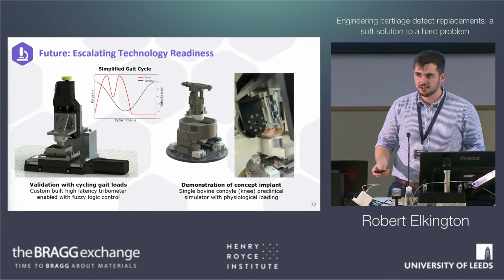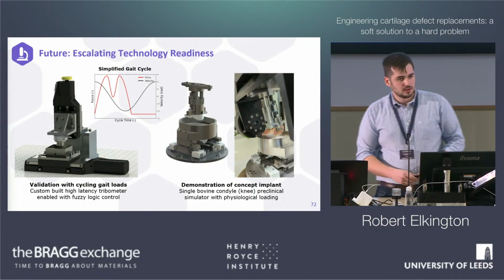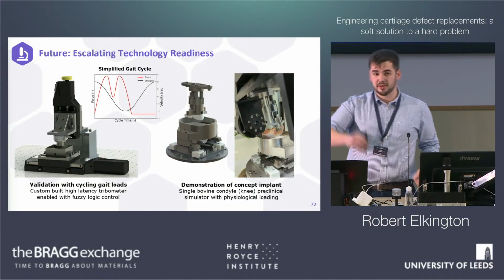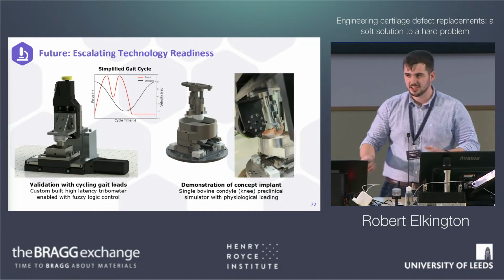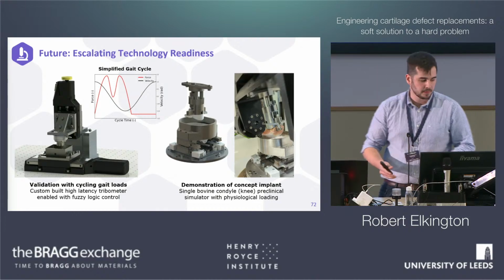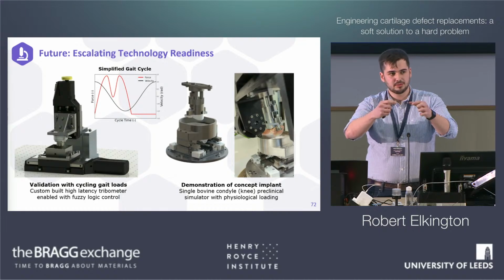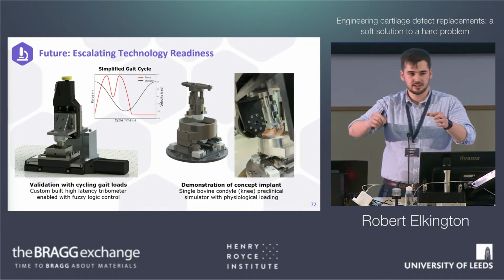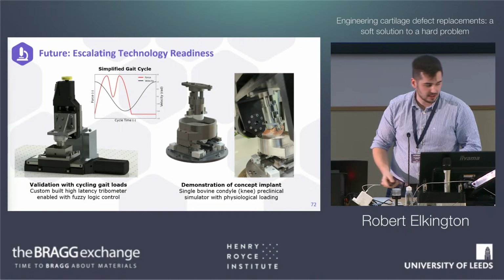I haven't actually shown you a direct validation of what it looks like compared to cartilage on cartilage data. That's because cartilage is a very uneven surface. In the test setup we've been working with so far, the PID, that closed-loop control, wasn't good enough. We weren't able to move on, basically taking the condyle sample from that bovine knee. It's curved. We can't move the contact and maintain the load of what we've shown so far. So we're having to develop some new hardware.